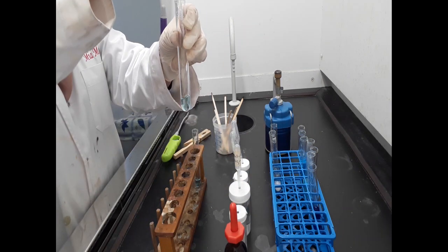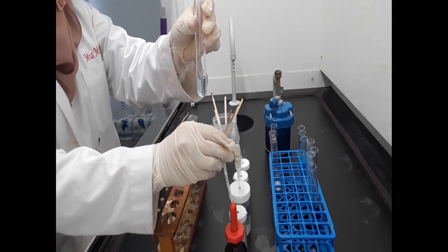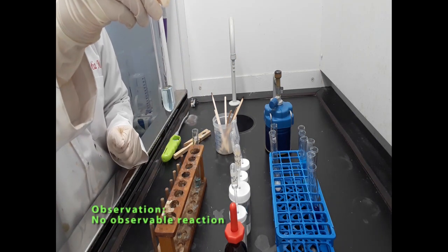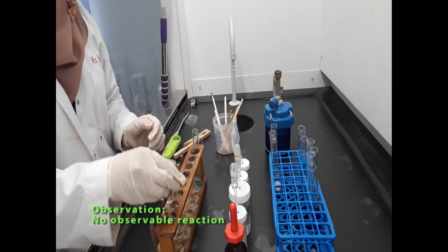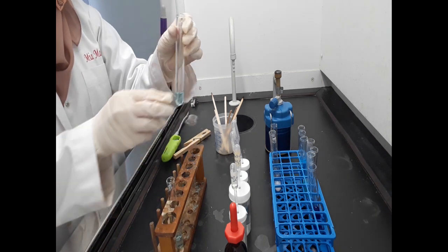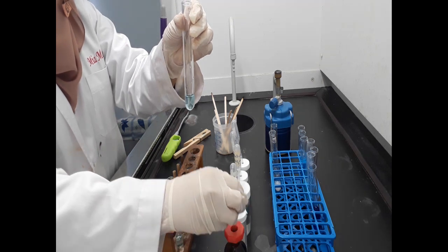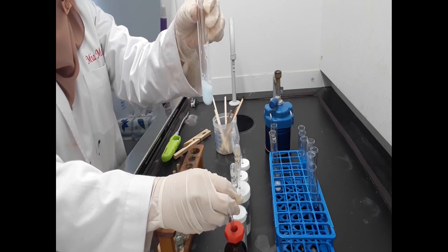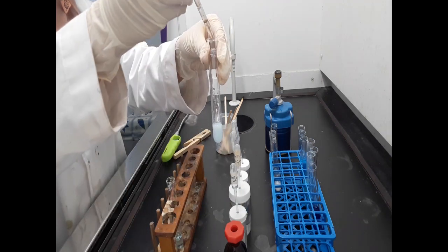And add an equal volume of aqueous barium nitrate. Still no reaction. And then to the other half of the mixture from A, add an equal volume of aqueous silver nitrate.